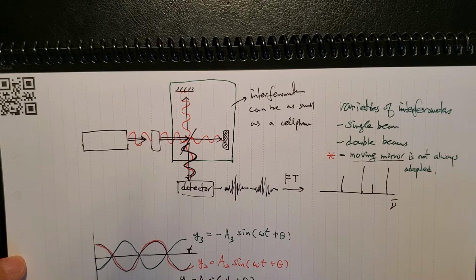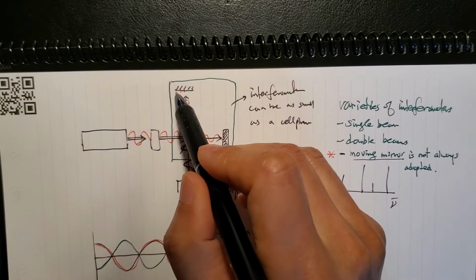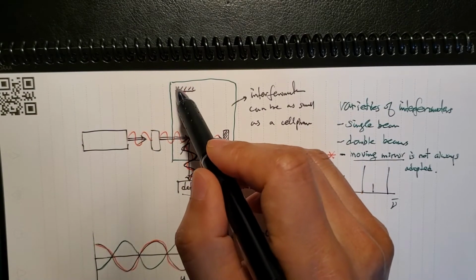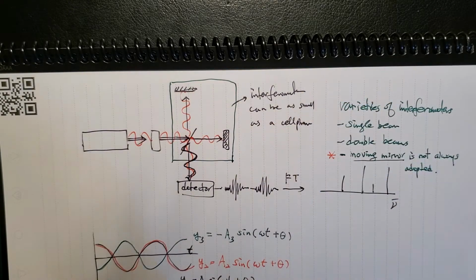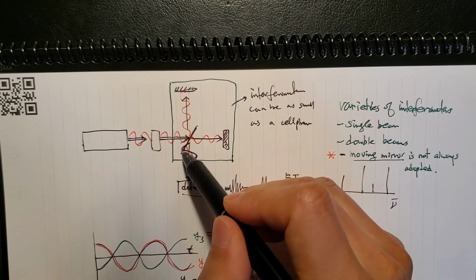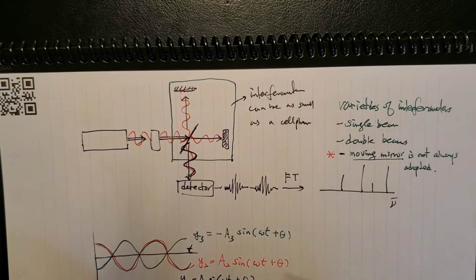So let's try to understand what happens inside. In the diagram, you see 3 mirrors. This mirror with the full reflective surface is fixed. The distance is precisely measured to the half mirror with a low density of silver on it.